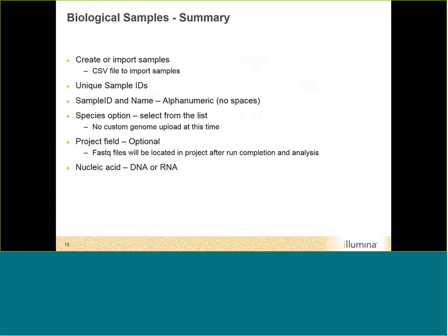Here is just a summary slide for you, to take back the features involved in the biological samples.